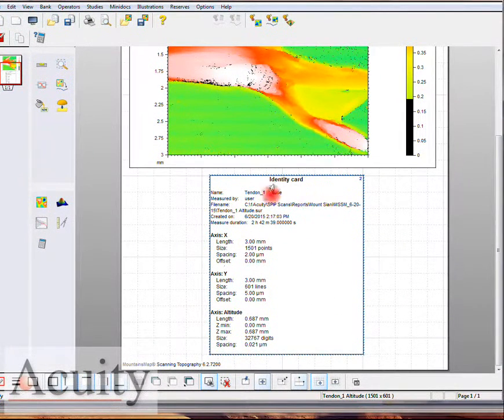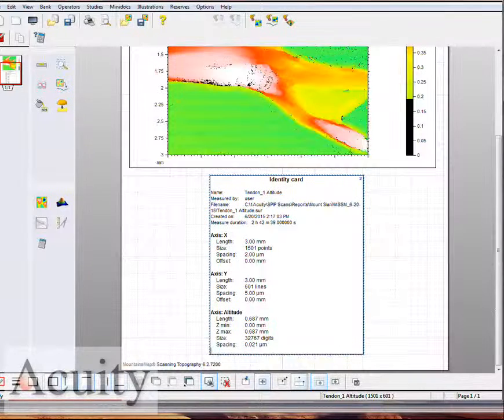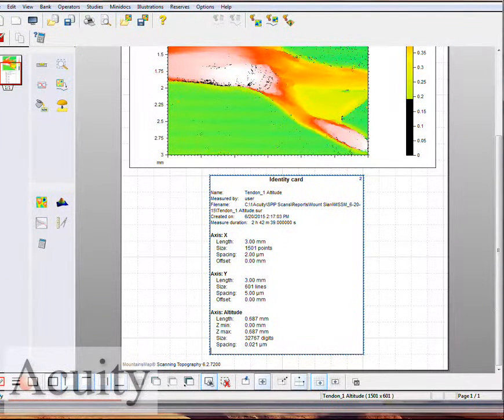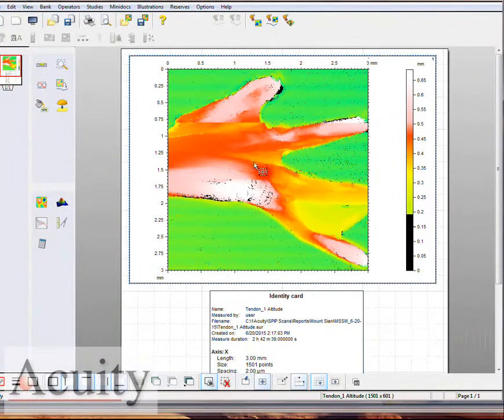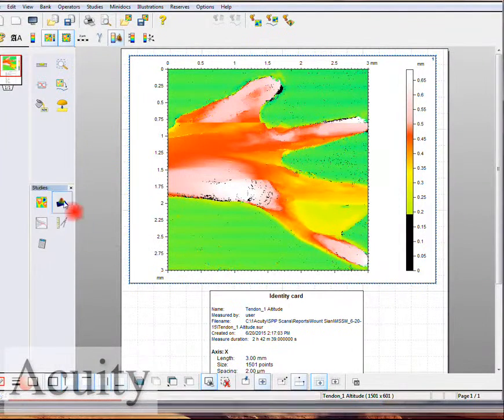Here's the little identity card. Once again, 3 millimeters by 3 millimeters. We took 1,501 points along the X axis and we dropped it down and we did 601 scans or profiles across that. So roughly we have a little over 900,000 points that we collected using this technology. Let's go ahead and take a look at this.